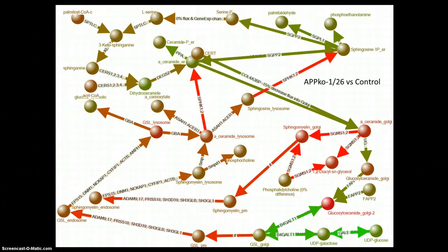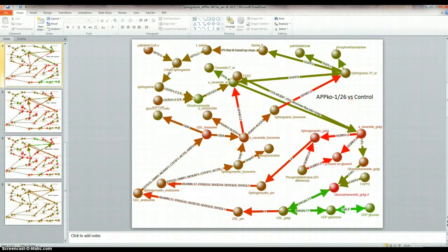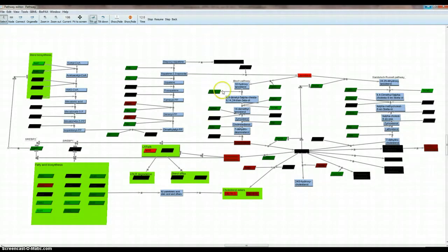And of course, the software I'm demonstrating, pathway, does not measure flux. All they are measuring is metabolite level changes through these time periods and gene expression changes. But the important thing to note is there's a lot of gene expression changes. Of course, they didn't measure a tremendous number of the components in the pathway, but just track desmosterol for instance.